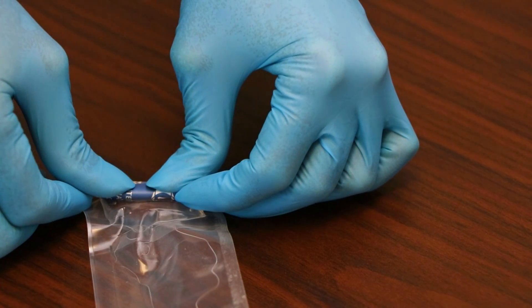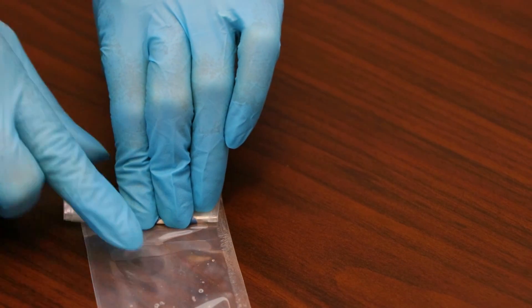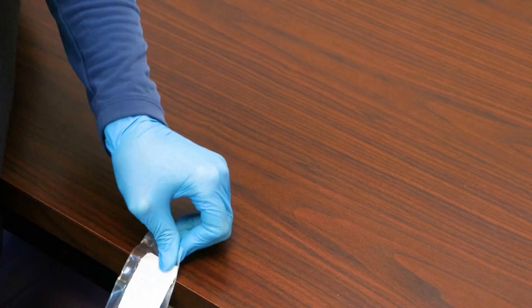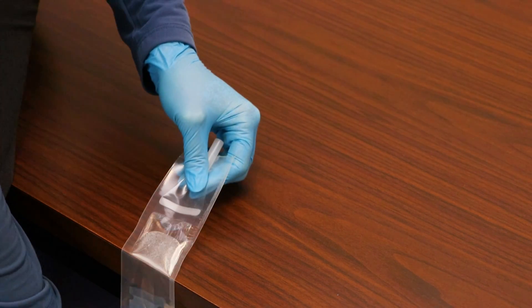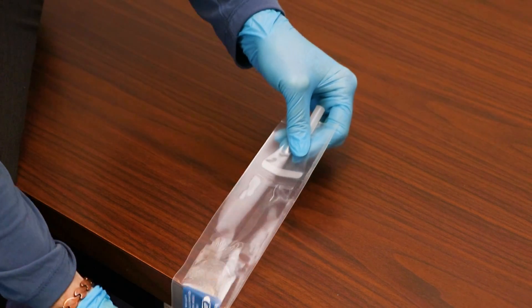Press down gently to burst the seal between the part A and the part B compartments. Then, run the twin pack sleeve back and forth from end to end over the edge of the table at least 50-60 times, or 25-30 back and forth cycles, in order to mix the liquid.